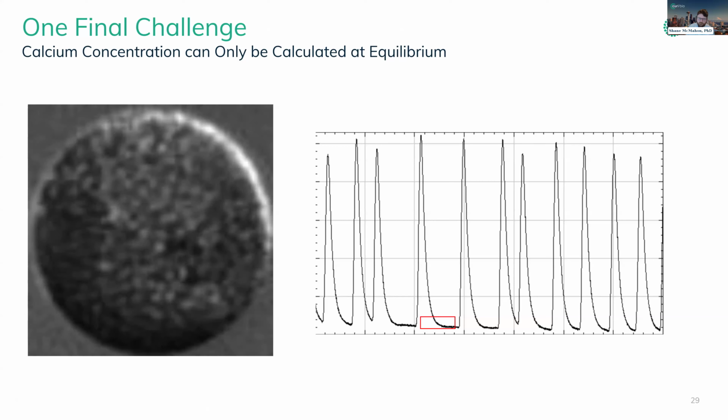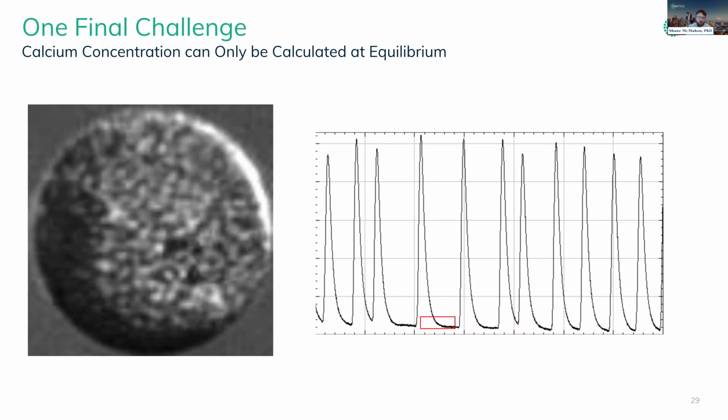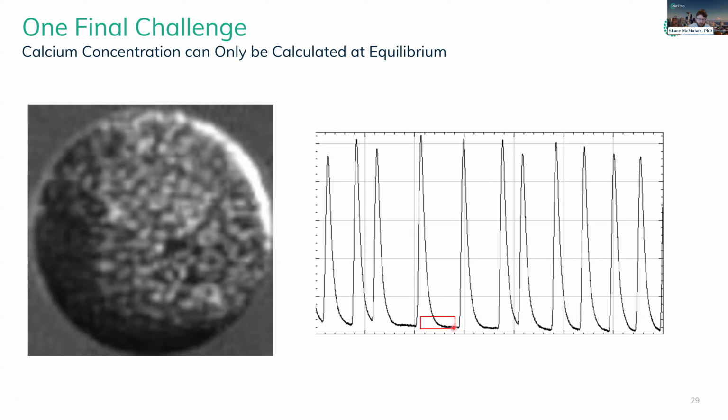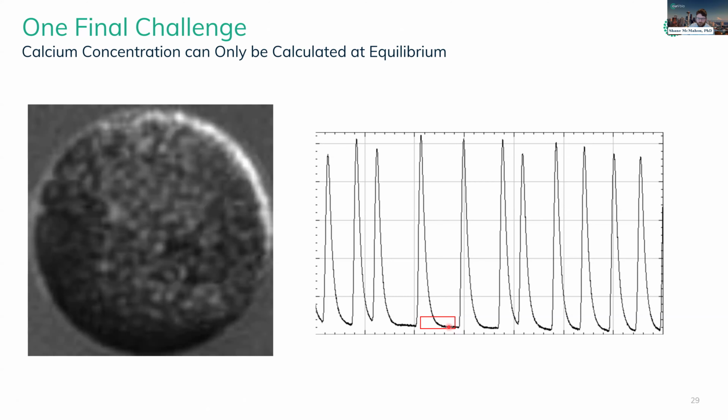One final challenge is that even after we addressed those, the calcium concentration can only be calculated at equilibrium. So that's down here where the changes are not very large. And arguably this is the least interesting part of our calcium imaging experiments.